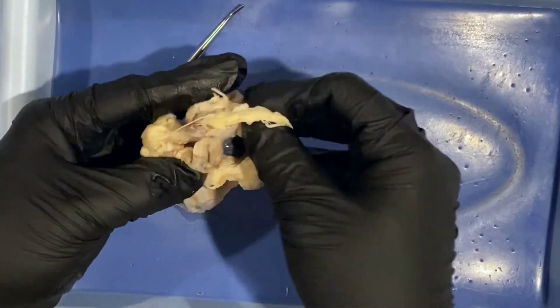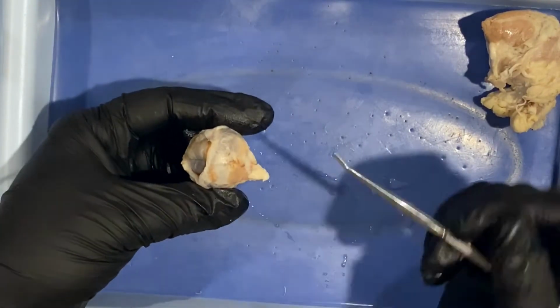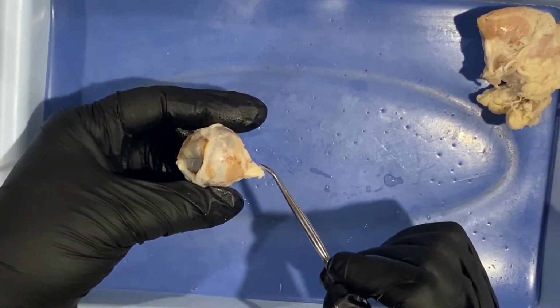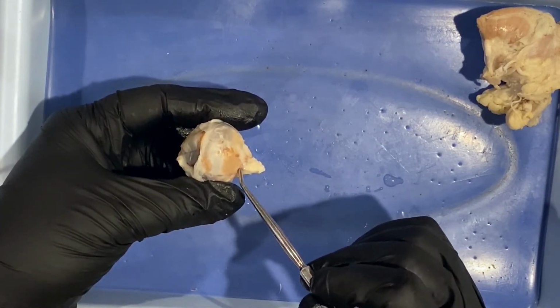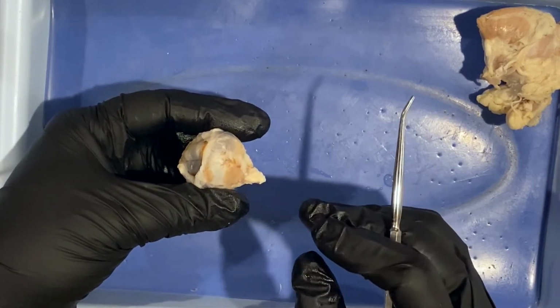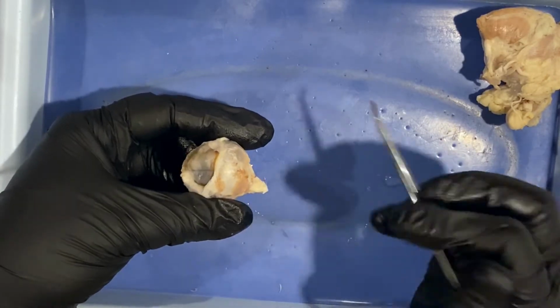So I've already cleaned up the one that we're going to work with, and the eye is divided into these things called tunics, and basically it just means a layer of the eye. The most outer layer is called the fibrous tunic. It's made up of connective tissue that has a lot of fiber, and it's a very rigid, hard structure. It helps to protect the eye, and it also gives the eye some of its shape.